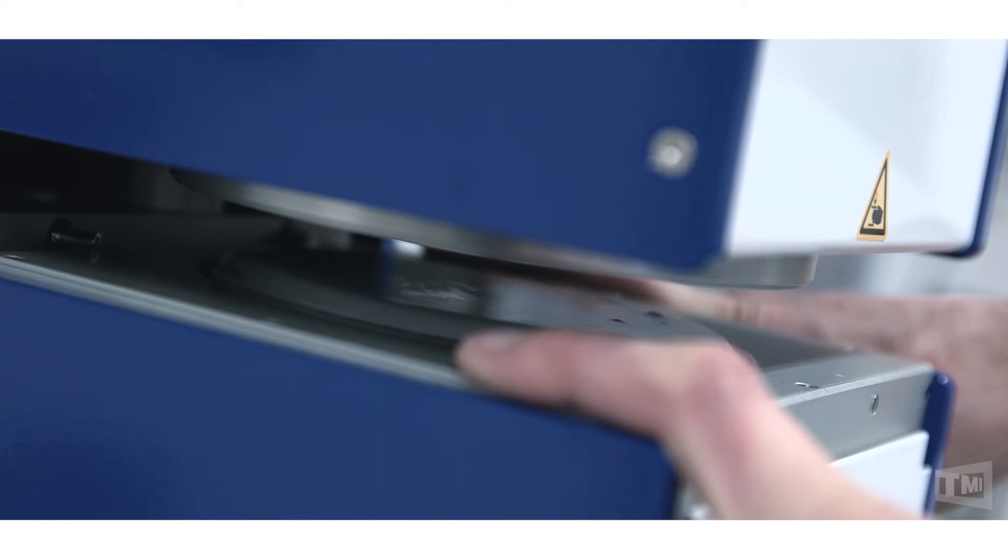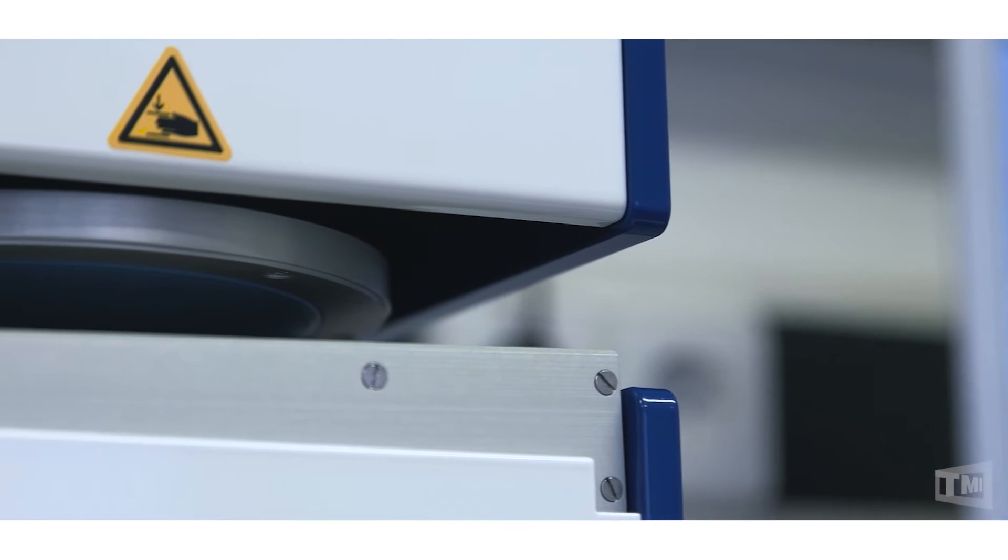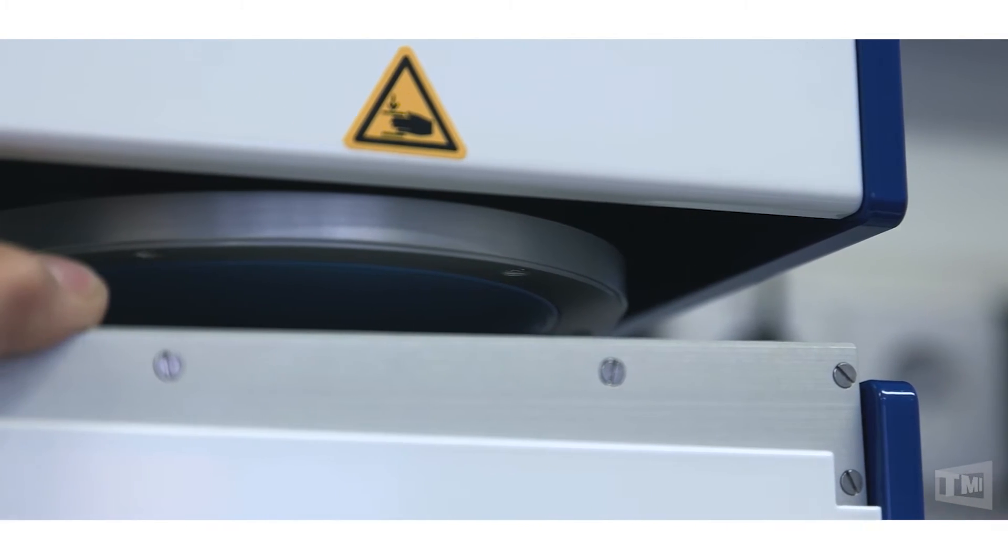We have two chambers. We have a chamber with an LVDT or sensor assembly and the other chamber where the actual water is transmitted into the porous glass disc and then into the paper specimen. The paper specimen is held by a rubber membrane.